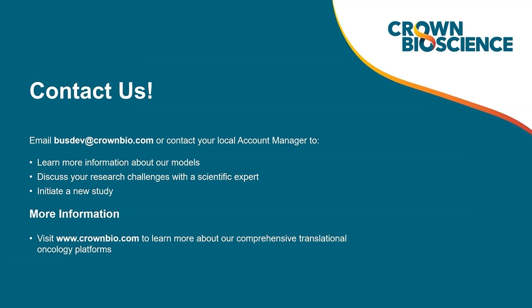It looks like we have two questions remaining that we have time to ask. So the first question is going to be, could you provide more details about the traditional run and separate strategy? Certainly. In the traditional run and separate strategies, researchers typically analyze PDX tumor samples containing a mixture of human cancer cells and mouse stromal cells. After data acquisition through mass spectrometry, computational algorithms are employed to assign peptides to either human or mouse proteins.